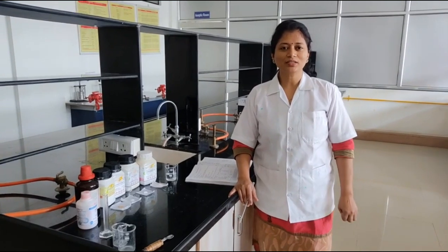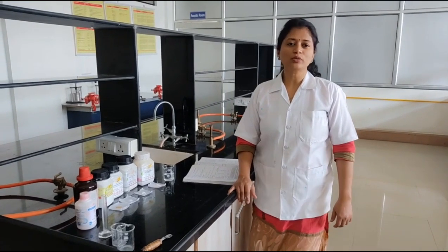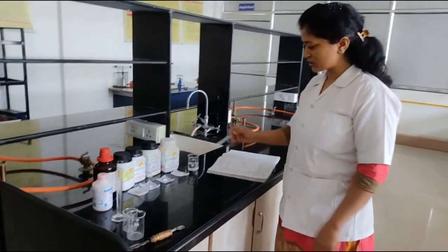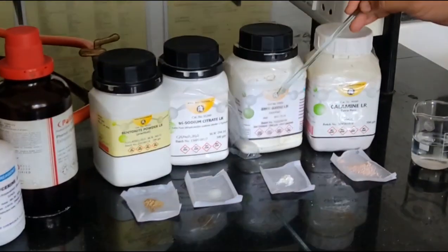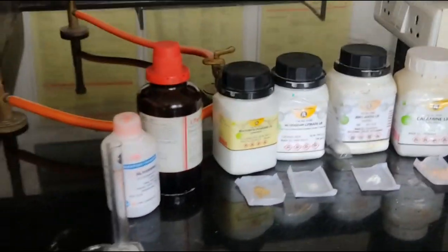Welcome, dear students, to our laboratory session. In this session, we see how to prepare calamine lotion IP. We prepare 10 grams of the calamine lotion. We see the chemicals required for our preparation. First of all, we require calamine, then zinc oxide, sodium citrate, bentonite, liquefied phenol and glycerin.